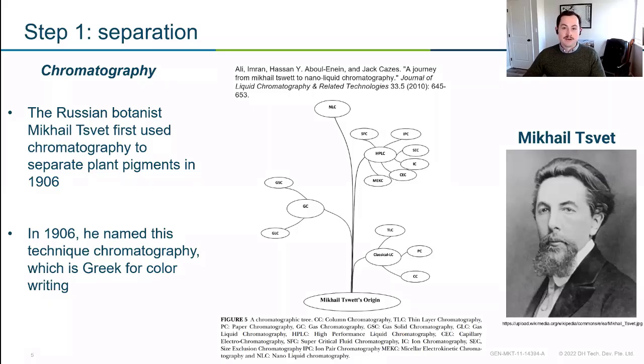Since that discovery, it has branched into two main fields when we talk about organic analysis, GC and LC. This presentation is going to focus on LC, but maybe you're familiar with GC. I know when I first started, I did a lot of gas chromatography. So maybe you're switching over, and let's touch on some of the key differences.